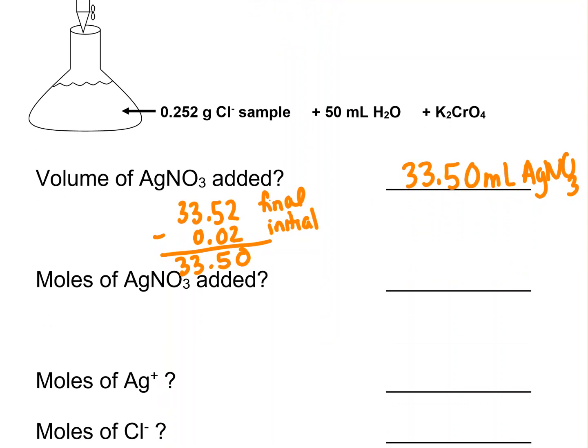So I need to know how many moles of silver nitrate that was. So I'm going to start with my volume.